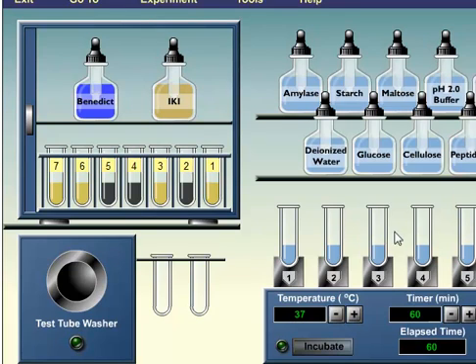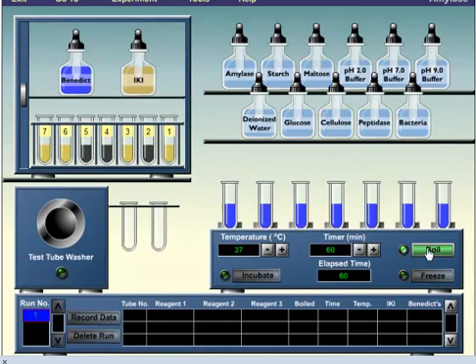What happens to the rest over here, those seven tubes? I'll boil it. Before we could boil these tubes, I have to add Benedict solution to each one. After adding Benedict solution to all of them, notice the color.